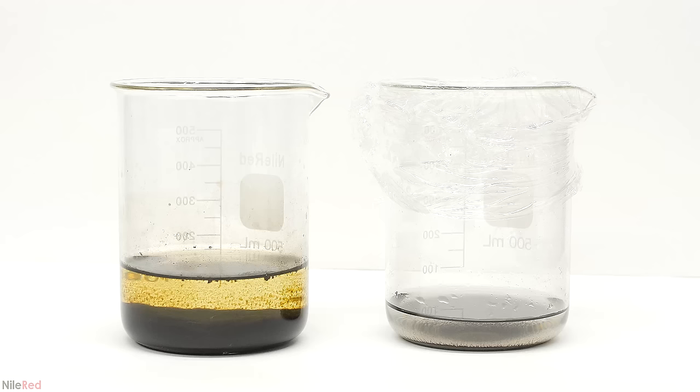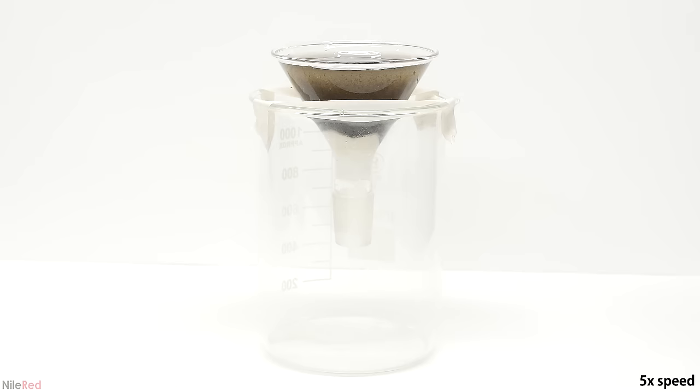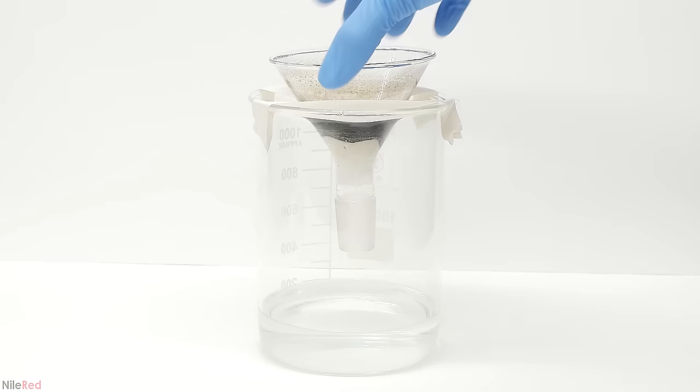When I came back, the manganese dioxide on the left had almost completely separated, and the mercury sulfide had also separated. I decided to deal with the left one first, and it was all filtered through a little bit of sealite. All of the manganese dioxide and the sealite is going to be kept as solid waste.